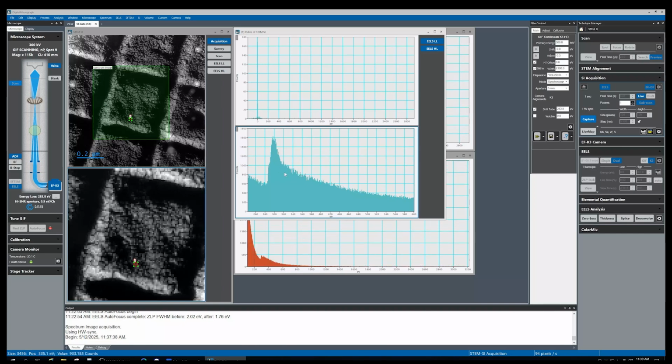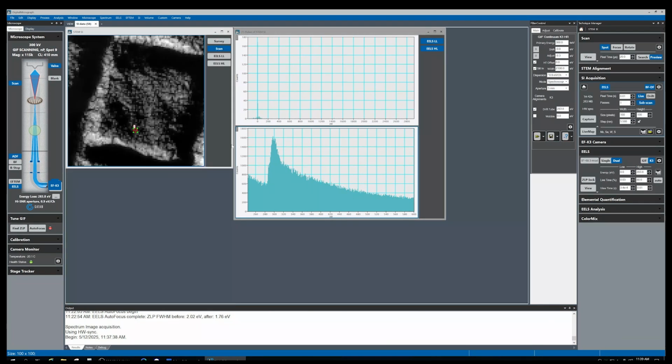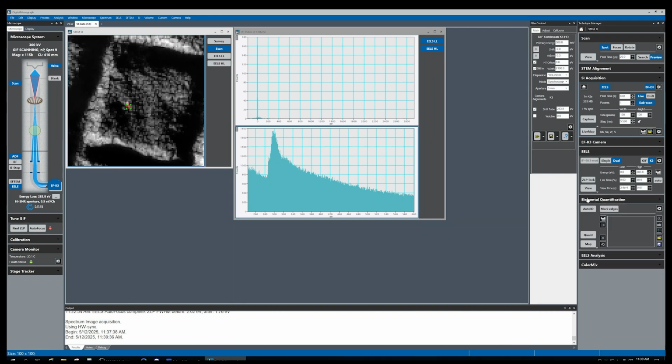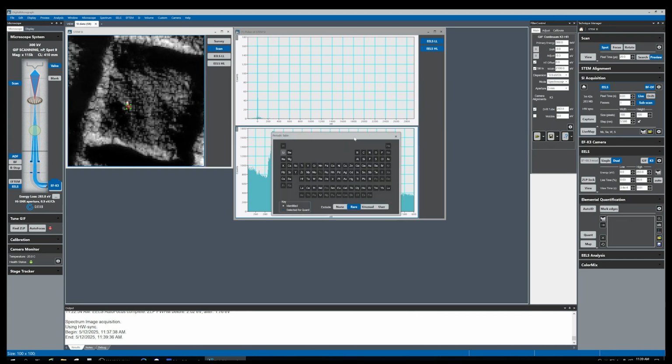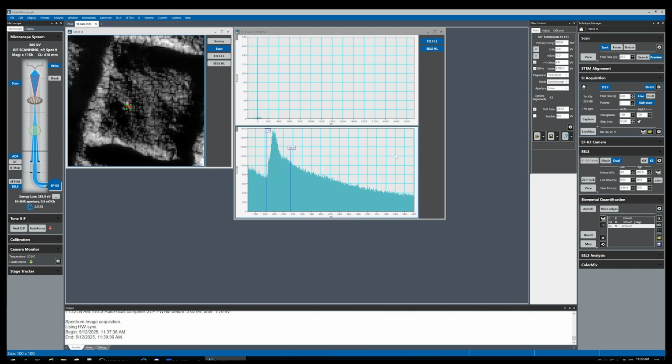And we can take a look. The palladium should appear over here, just right behind the carbon edge. Now the scan has completed. We can go to this elemental quantification palette and select the elements we want to map. So carbon, and we have palladium, and we have gold.